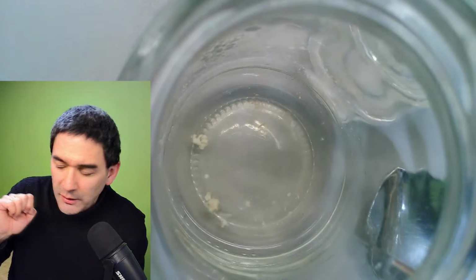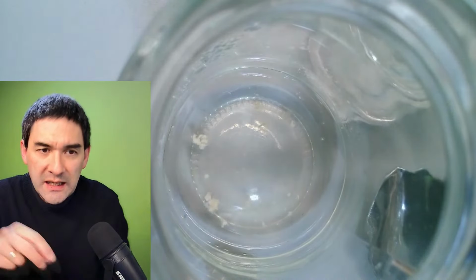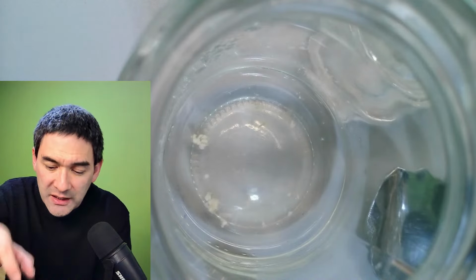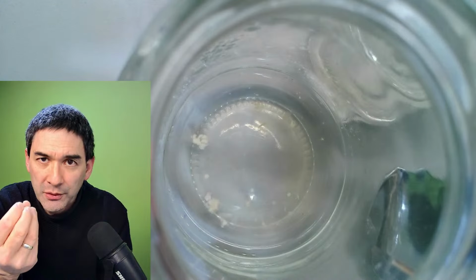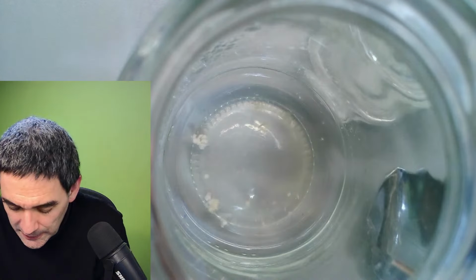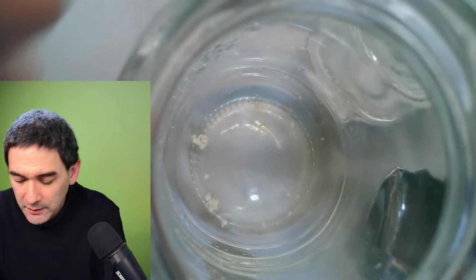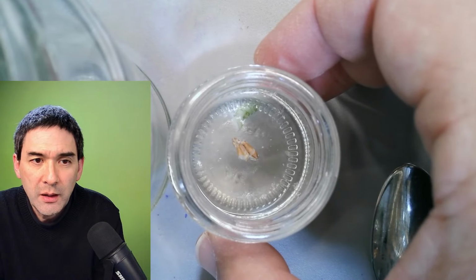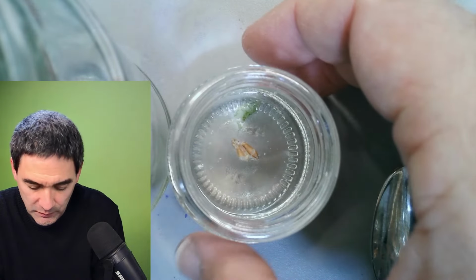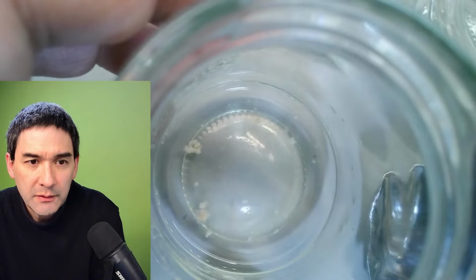It's now a little bit more difficult to actually take out a sample from there, because I cannot go in with a tweezer and pick it out and dip it on my microscope slide, because it falls apart. For convenience, I found the crushed cereal grain to be way more effective, even though this one should also work.